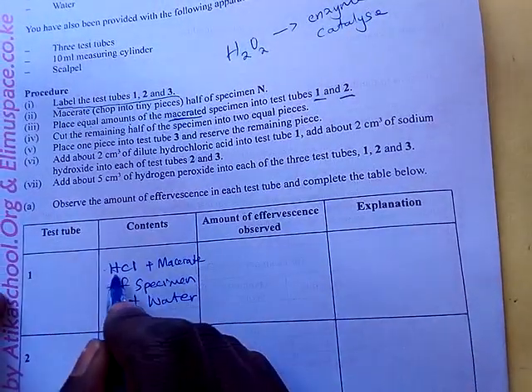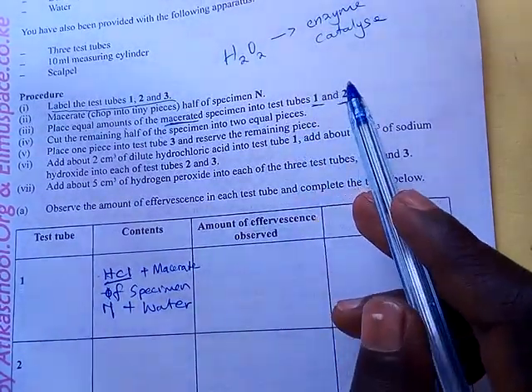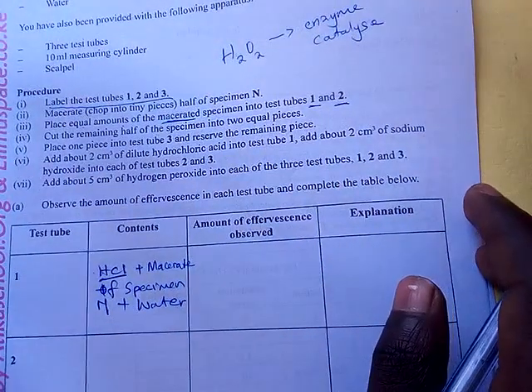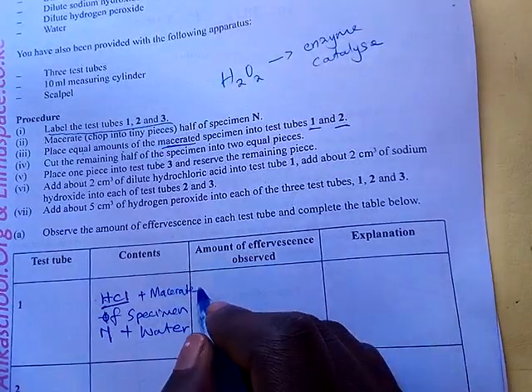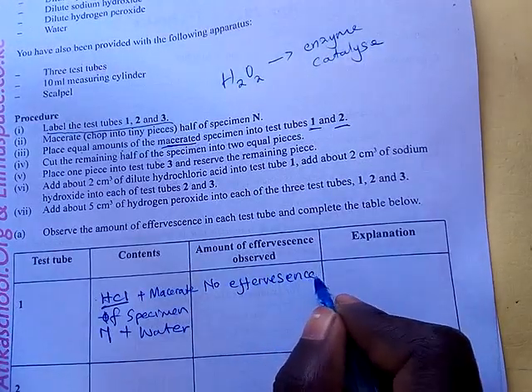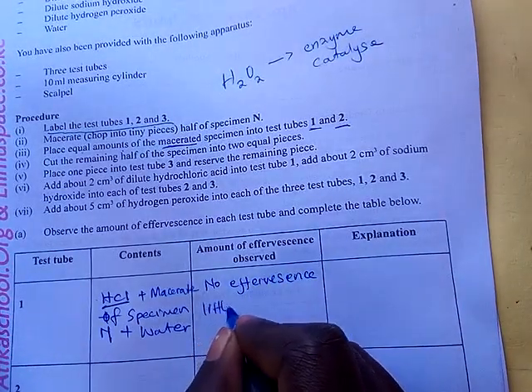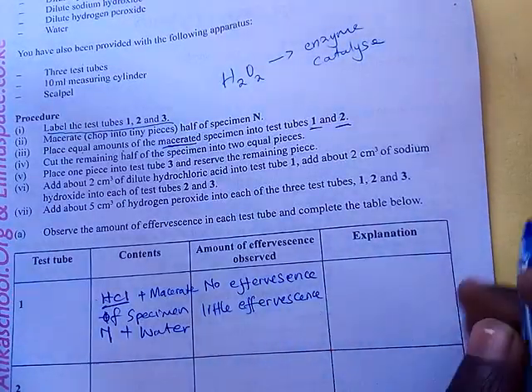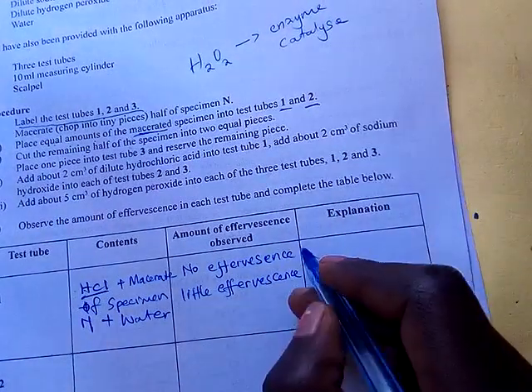First of all, when you see HCl being added, and you know you are testing for enzyme catalase, the acid denatures the enzyme. So here, for the amount of effervescence, there was no effervescence because the enzyme was denatured. Both are acceptable. For the explanation, you'll say the acid denatured the action.